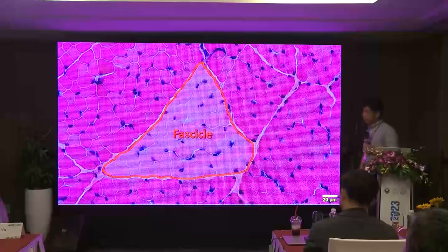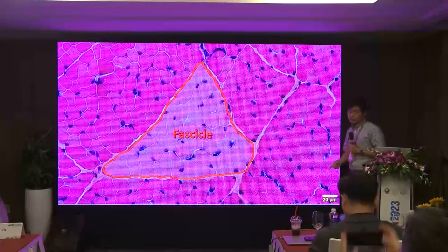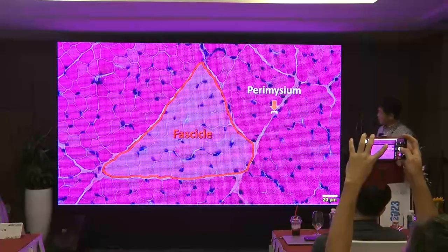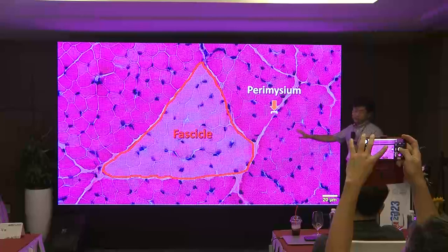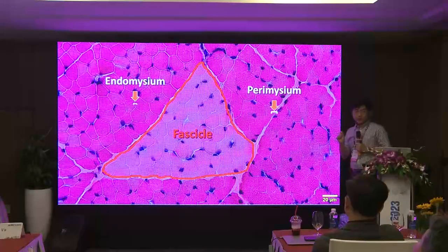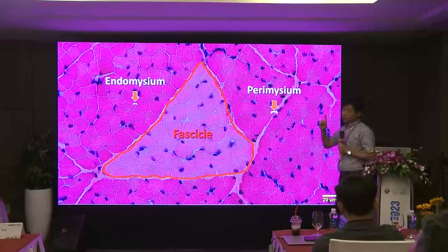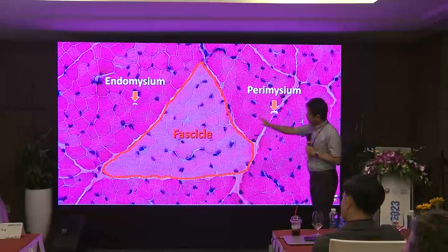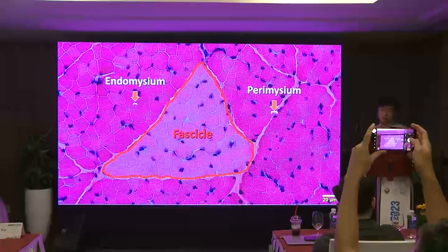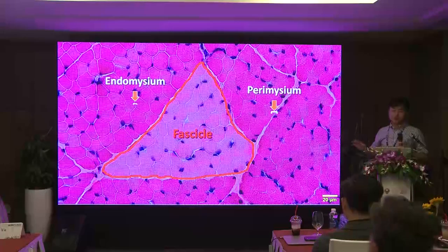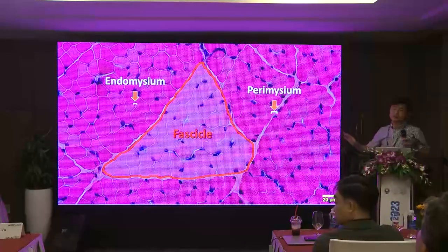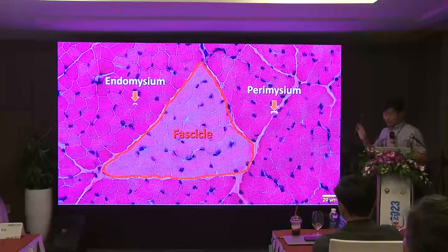This is a normal muscle. Each fiber is not distributed uniformly — they make clusters called fascicles. There are two types of interstitium: the space between fascicles is called perimysium, and the space between myofibers within a fascicle is called endomysium. The terms endomysium, perimysium, and fascicle are very important to understand muscle pathology. Please do not forget these three terms.